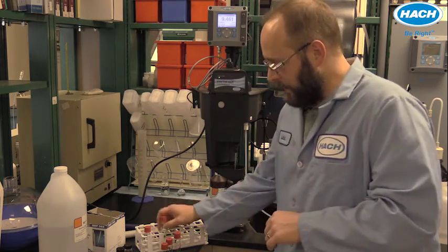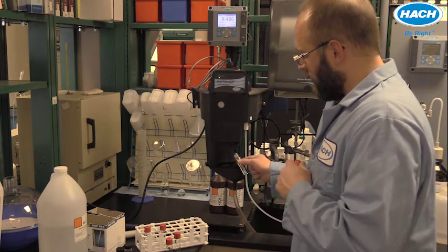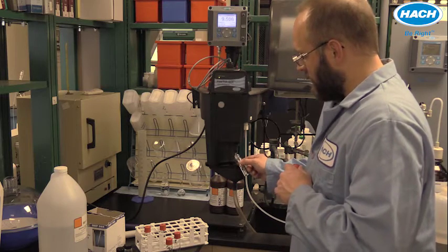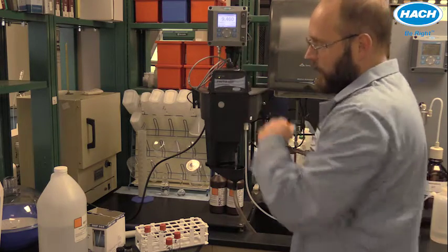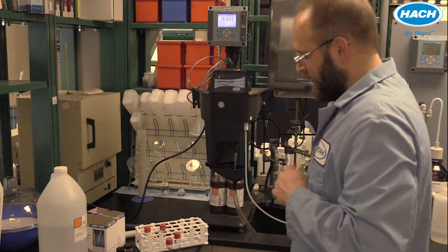I'm going to do that with 4 consecutive samples, again assuming that we're at a steady state so that the turbidity value hasn't fluctuated greatly for a period of 20 to 30 minutes prior to the sampling.